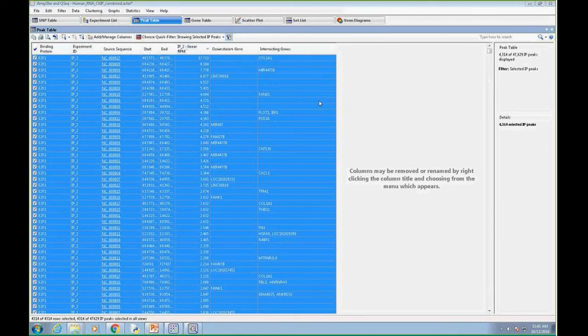And now, at this point, I've got a subset of both downstream genes and intersecting. So I'm not quite sure where my transcription factor is going to modulate the transcription. It may be upstream in the promoter, or it might actually be within the gene itself, the gene annotation. And so, again, I have information then from these two different sources that gives me this kind of combination table. And now I can look at them.